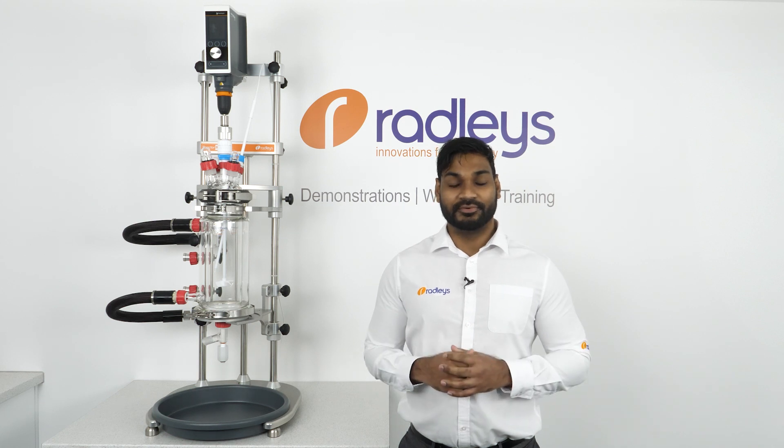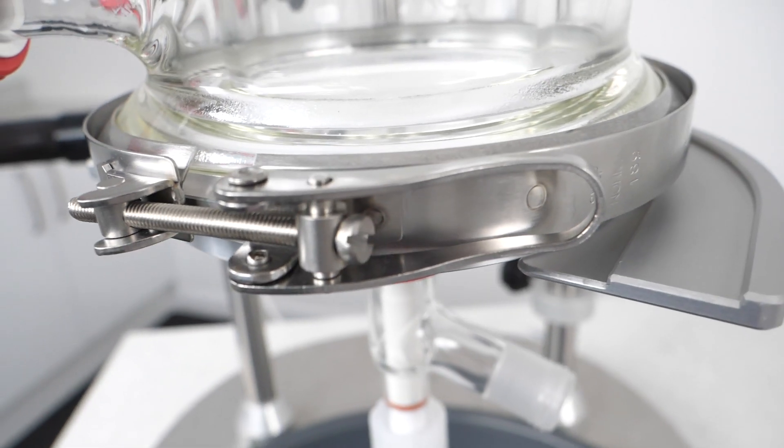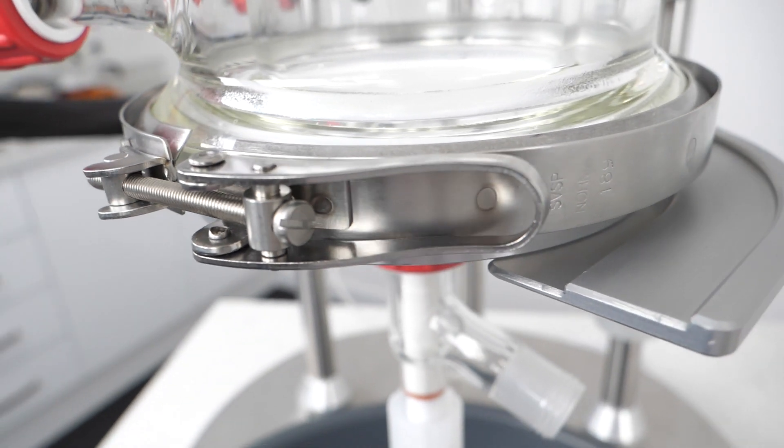Saving you the hassle of transferring your chemistry into another vessel. Our filter vessels can be used for reaction workups or powder drying. They can also be used purely for doing reactions or as a standalone filter.